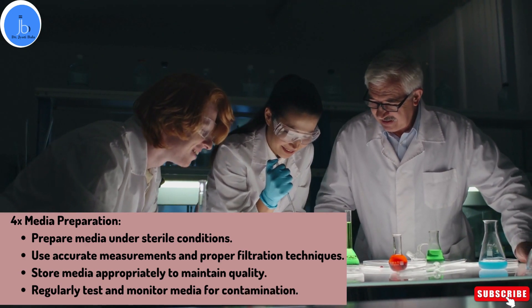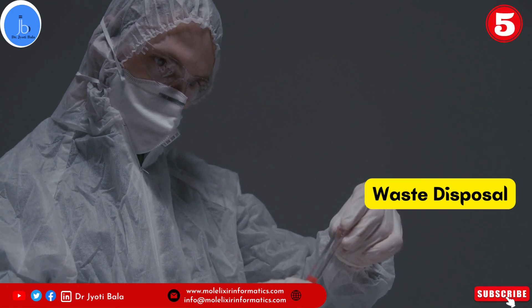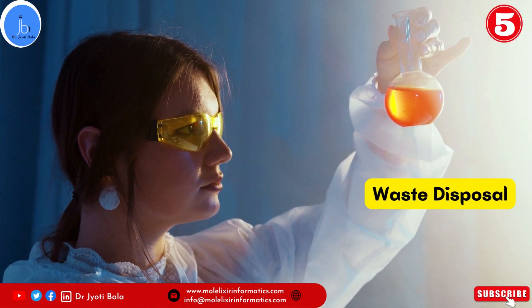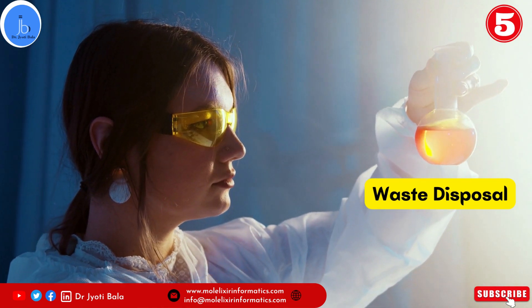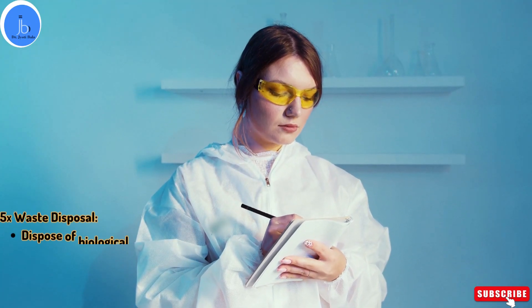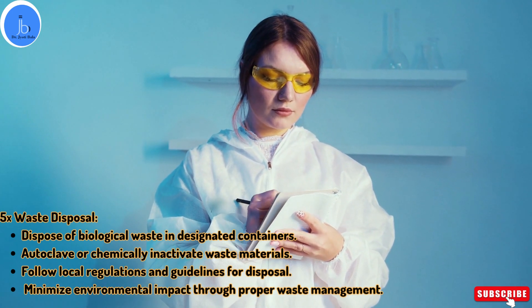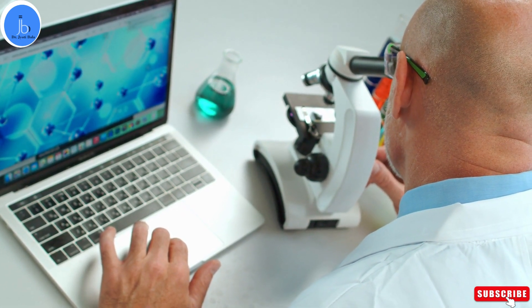And lastly, waste disposal. Proper waste disposal is vital for both safety and environmental reasons. Dispose of biological waste in designated containers to prevent any potential hazards. I myself have worked in the virology area, where I have handled HIV, influenza and measles virus. During those experiments, we followed biosafety rules and regulations while handling those diseases. Additionally, autoclaving or chemically inactivating waste material before disposal ensures they are no longer infectious. Always follow biosafety regulations and guidelines for waste disposal. By practicing proper waste management, we can minimize the environmental impact of our lab activities.